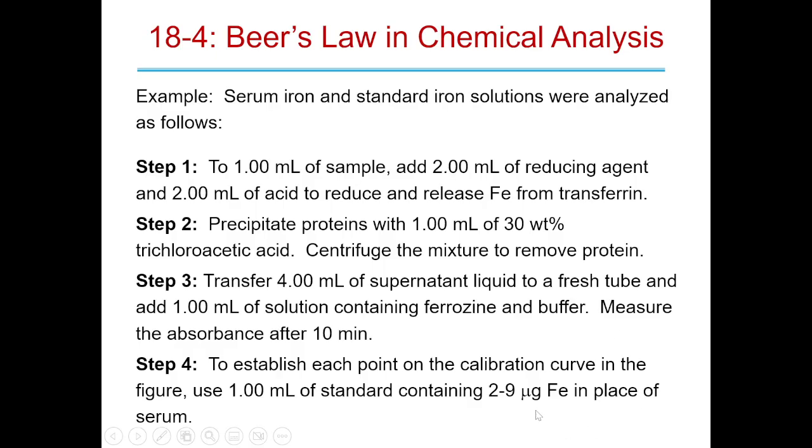Yeah. And one of the reasons you do that, change the standard and check, is because you don't necessarily know where your dynamic region is with that instrument and with this set. So, okay, why would you be changing the standard? Like, what exactly is the standard being used for?